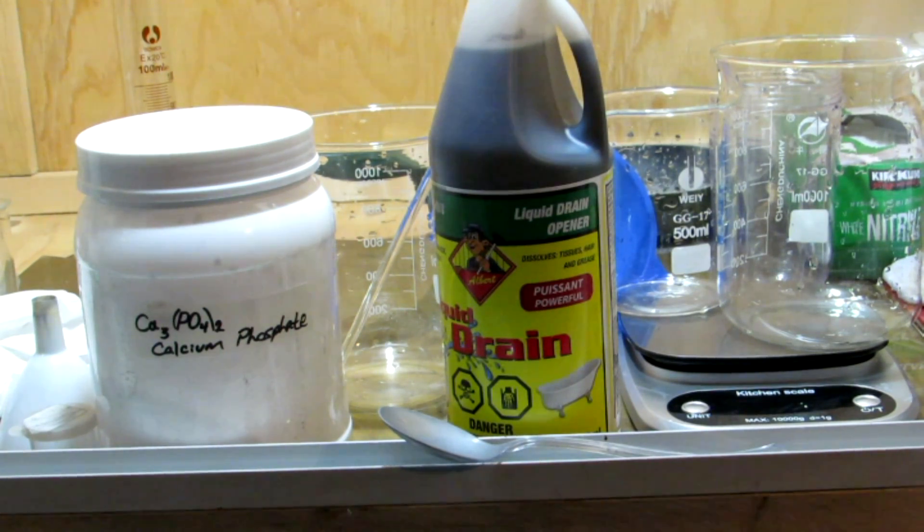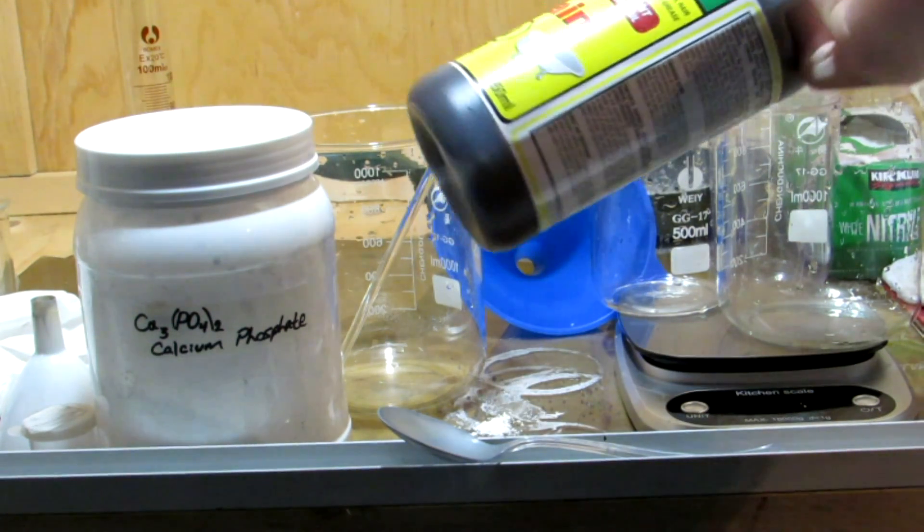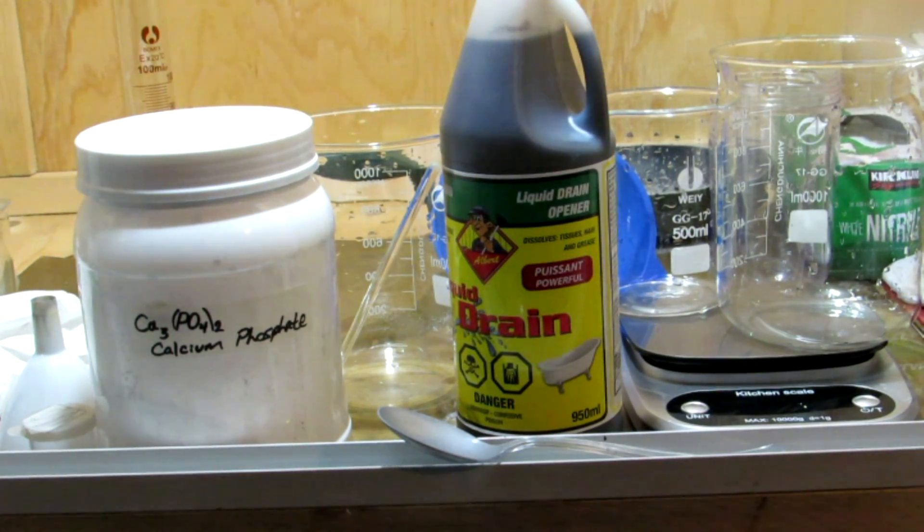Hey guys and welcome back to another video. Today we're going to be making monosodium dihydrogen phosphate. This chemical can be made fairly simply from calcium phosphate, sulfuric acid, and sodium hydroxide. These are all easily obtainable from household materials. Sulfuric acid is found at hardware stores such as Rona, which is where I got mine.